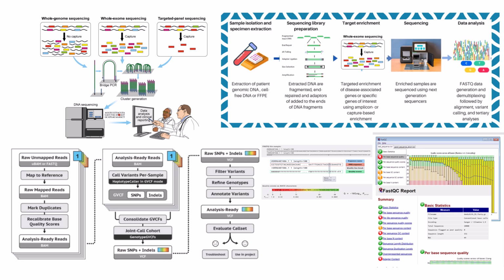And the absolute bedrock, I guess, is the human reference genome, HG38 you mentioned. That's it. That's the standard agreed-upon genetic blueprint of a notionally healthy human. Think of it as the master map. Every piece of patient data we analyze gets compared against this map to spot the differences. Okay, so that's the map. But you said not all differences matter. Exactly right. Many differences are just common, harmless variations found across populations. So alongside that master map, we need these huge catalogs of known variations.